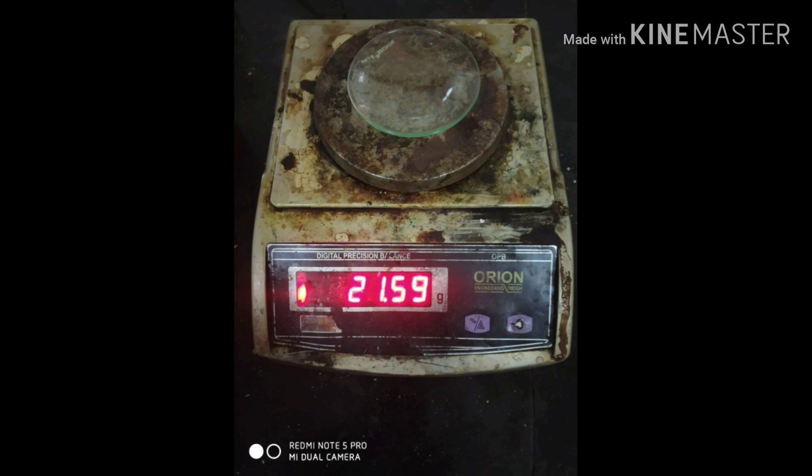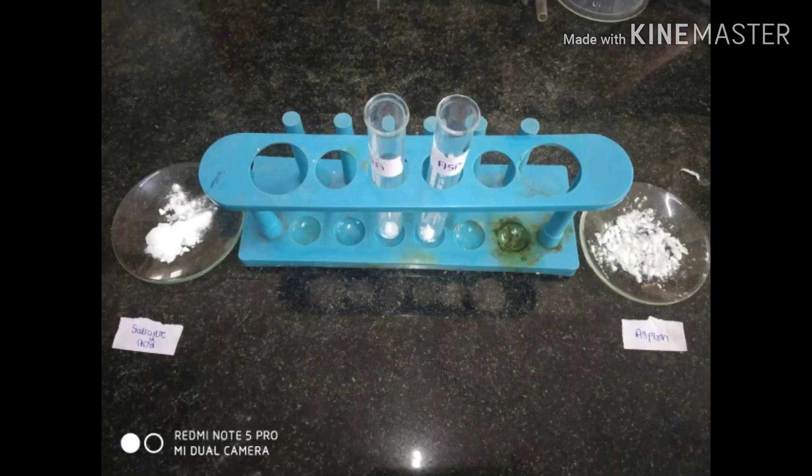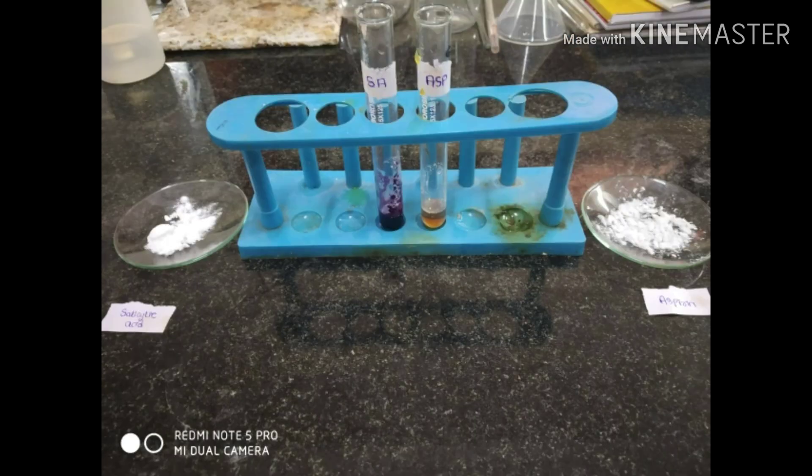The yield obtained is about 1.15 grams. To confirm this yield, we perform a confirmatory test using ferric chloride. Upon addition of ferric chloride to both aspirin and salicylic acid, the salicylic acid shows a violet color while aspirin shows a slight brown color. This confirms that the obtained yield was aspirin.